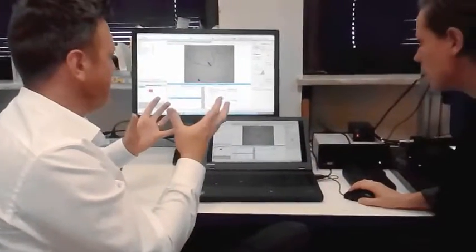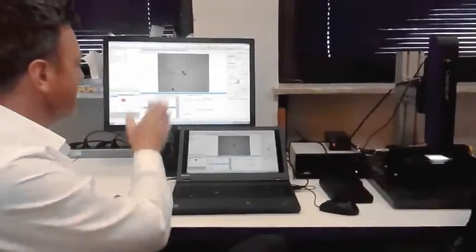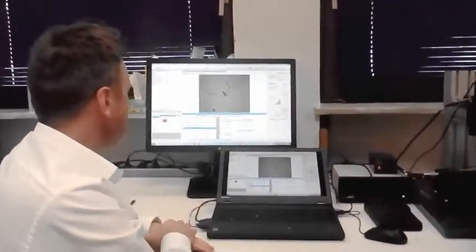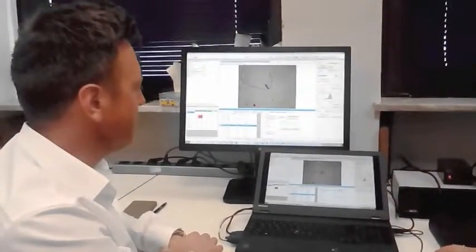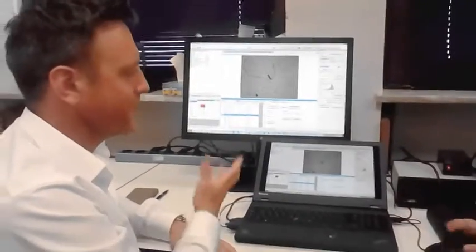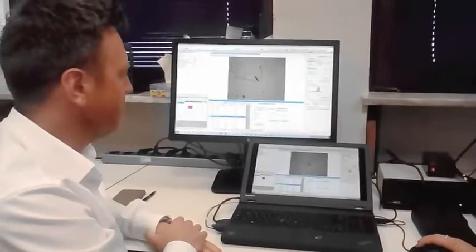So things that we're marking here will then feature in the report that we create, which again is just literally a one-click button. Okay, that's good. So should we do this? Let's do that. Let's have a look at the export. So we have a number of options here. The most popular by far is Excel. So an export directly into Excel.